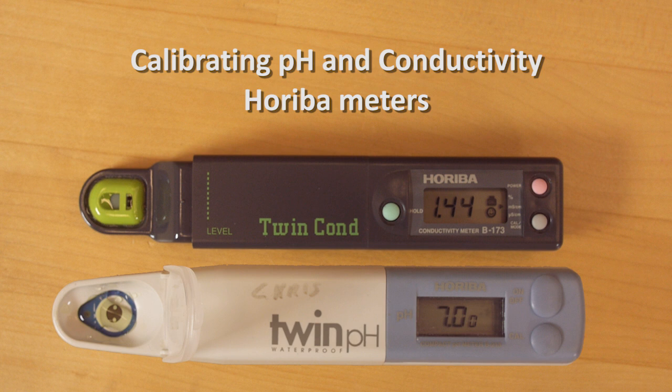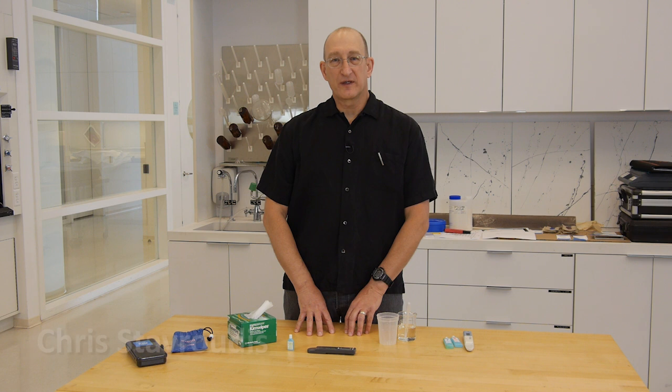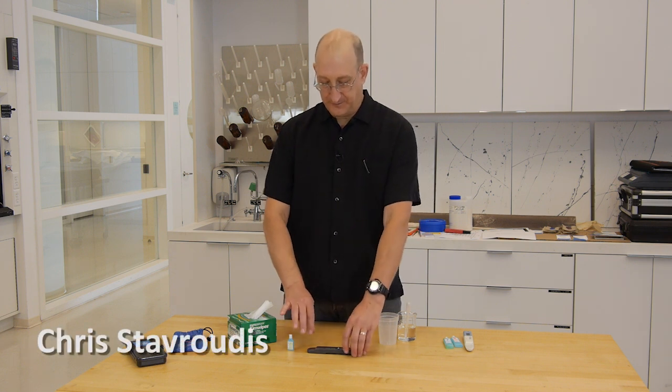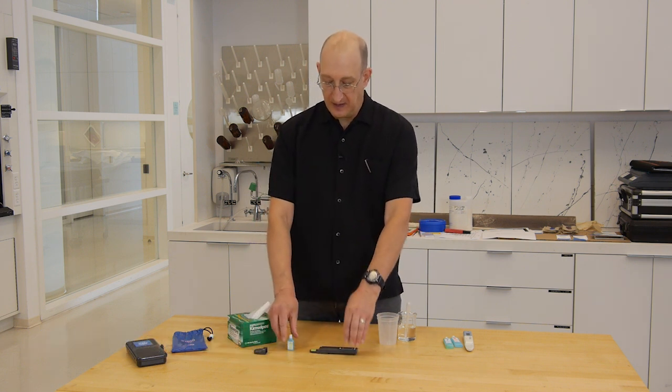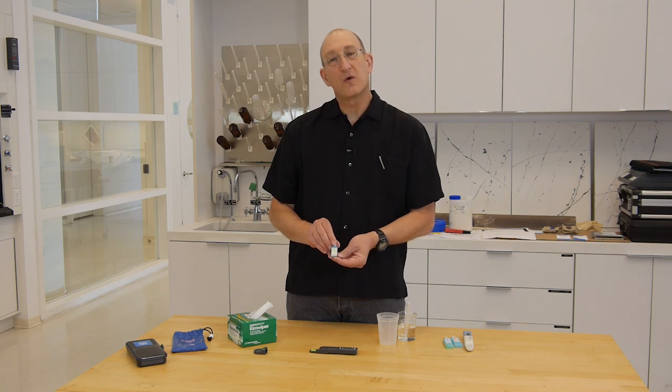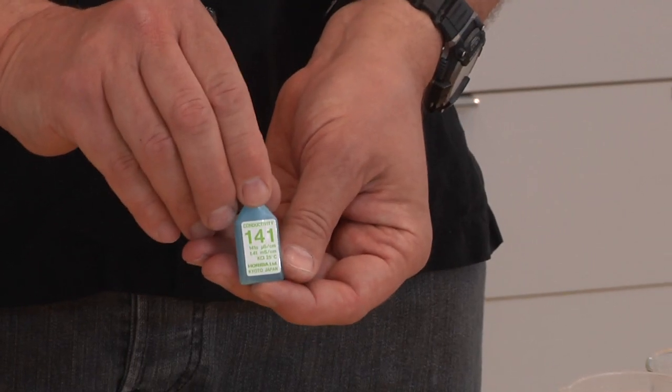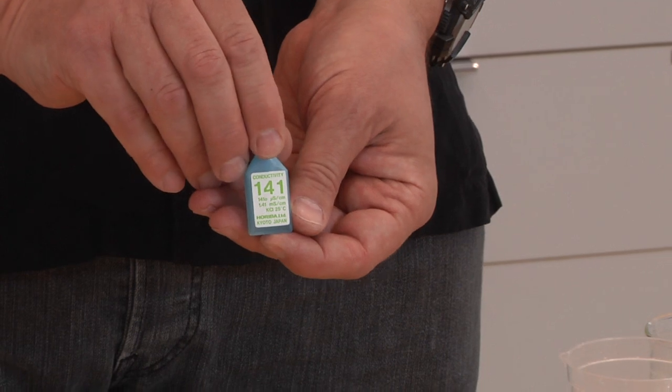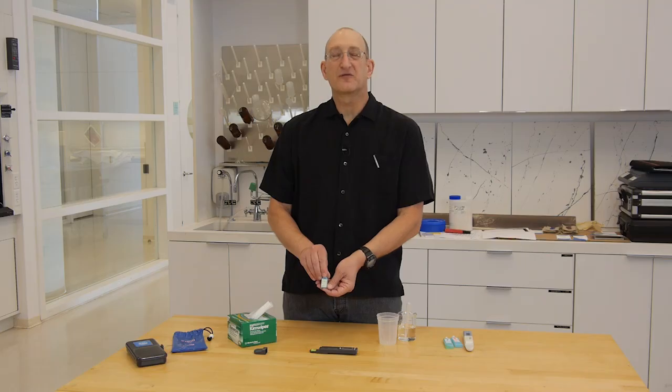To calibrate the Horiba conductivity meter, we start with turning the meter on, removing the protective cap, and we'll use a 141 calibration solution, which is 1.41 millisiemens per centimeter, or 1,410 microsiemens per centimeter.